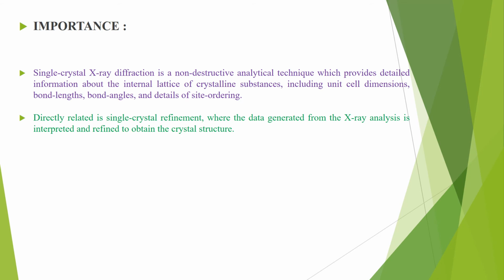It provides detailed information about the internal lattice of crystalline substances.